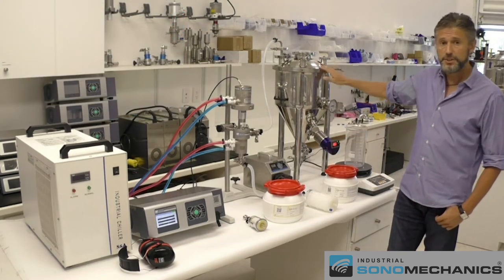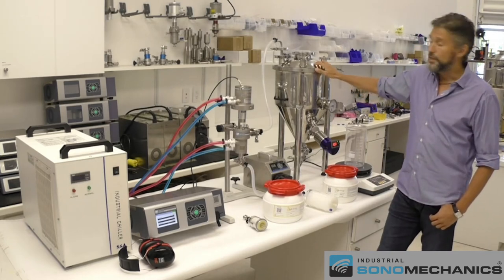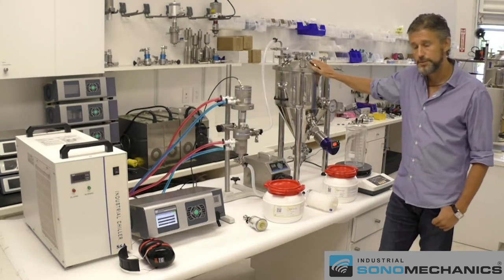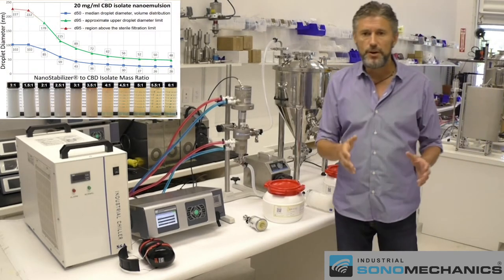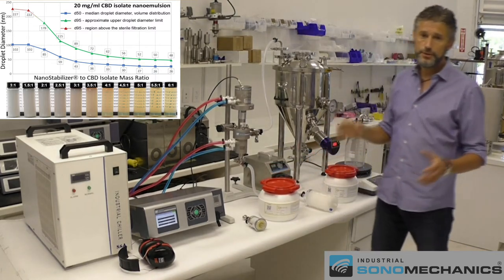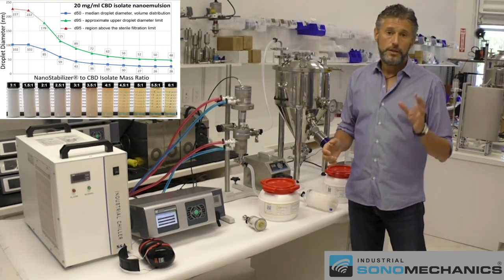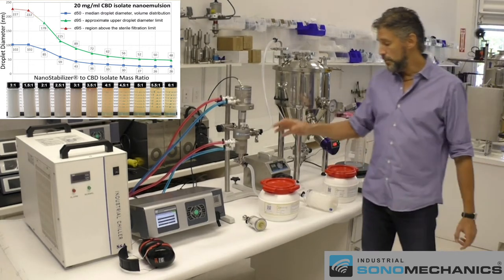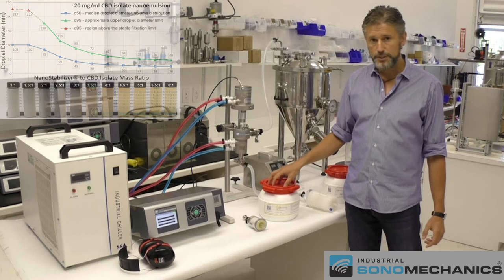The standard amount that comes with the system is 25 liters, which means you can comfortably make about 20 liters at a time. The productivity is 5 liters an hour, so making 20 liters will take about 4 hours to process. For specific amounts of cannabis extracts or other bioactives, the amount of Nanostabilizer LT or LSO, and the water ratios, you can refer to our nanoemulsion processing guides available on our web store.